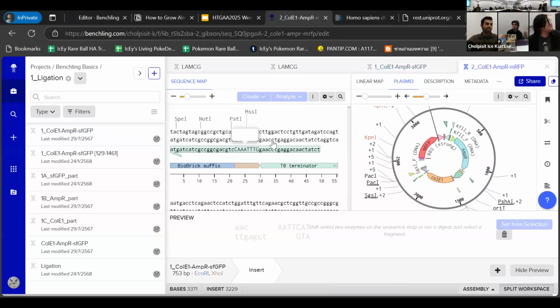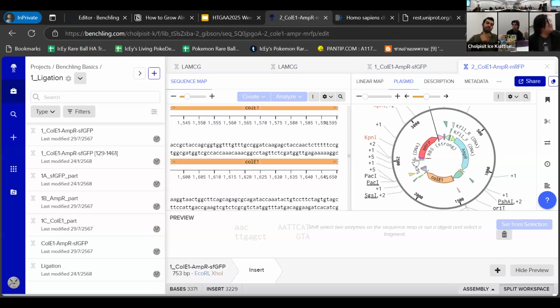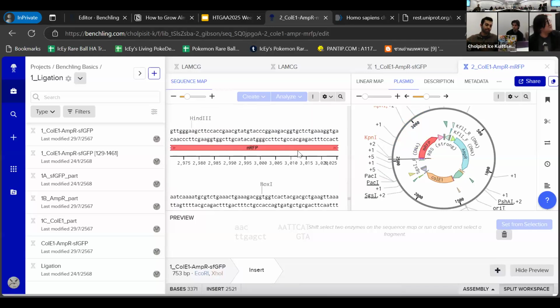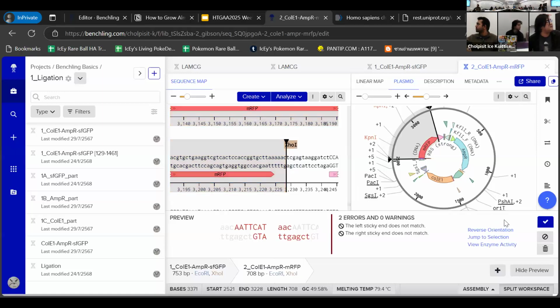So this really saves a lot of time by doing the preparation ahead of time to make sure that whatever errors occur, either because, let's say, something happened with reagents, or it's just a major issue with your plasmid, you catch them early. Absolutely, yeah. We call this process in silico cloning.